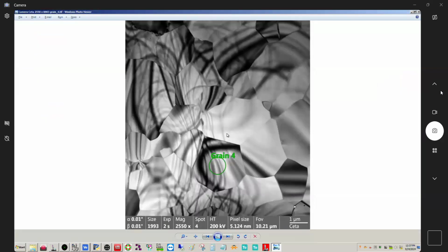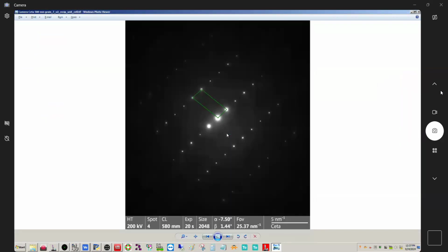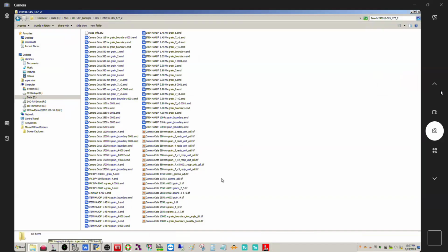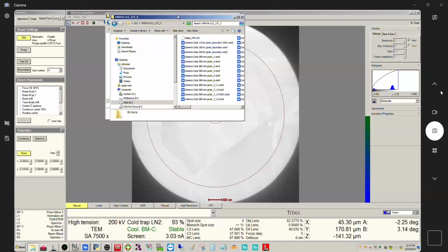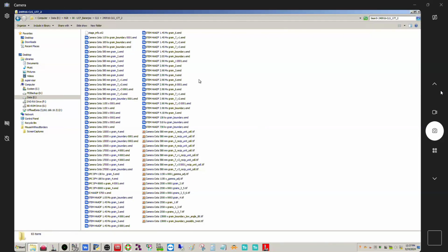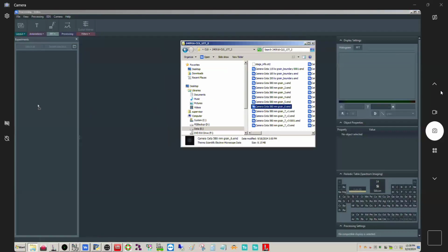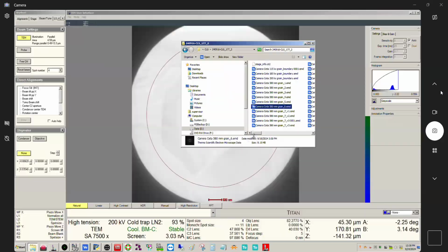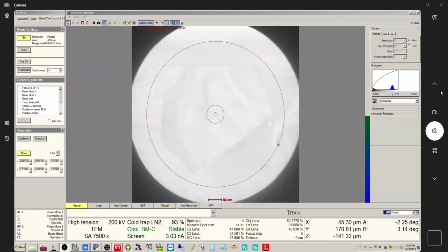So what are we looking for here? So I didn't save the reciprocal unit cell for grain 6. It's very odd. Let me open this up here. Okay. Yeah, this is kind of interesting here, but I wanted to do one that was a little more higher symmetry. So what do we have here?